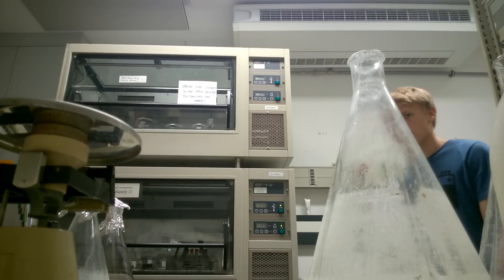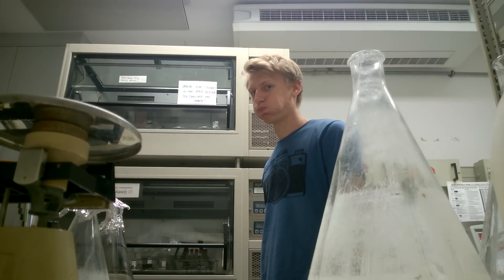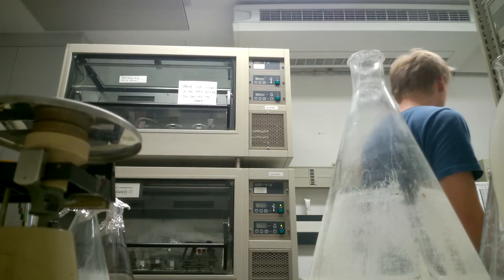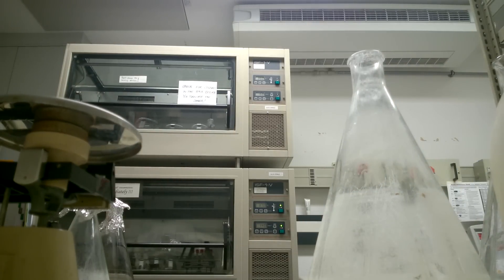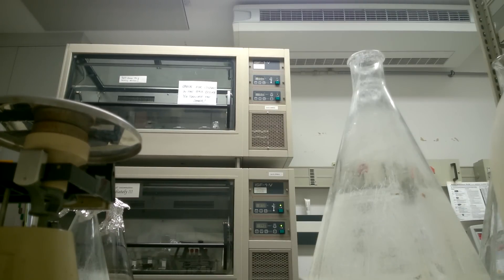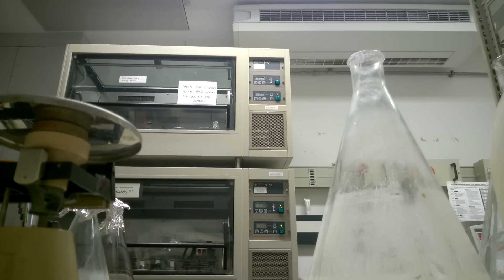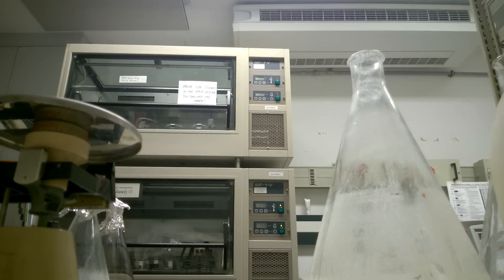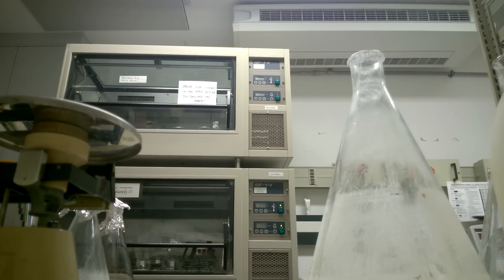Most of the time it's just me waiting for the centrifuge to be done. It's only five minutes per spin — the protocol says ten minutes, but I've mostly done only five minutes to be faster and it usually was long enough. The important thing when you're centrifuging is that you always balance out the load, but I'll talk more about that a little later. Sounds like the centrifuge is done — I'll just open it up.